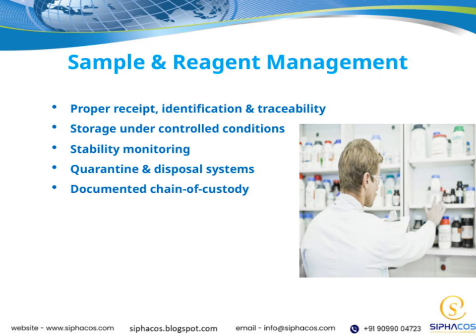Next, storage under controlled conditions is vital to preserve the quality of our materials. This involves maintaining appropriate temperatures, humidity, and security measures to prevent degradation or contamination. Stability monitoring is another key point.